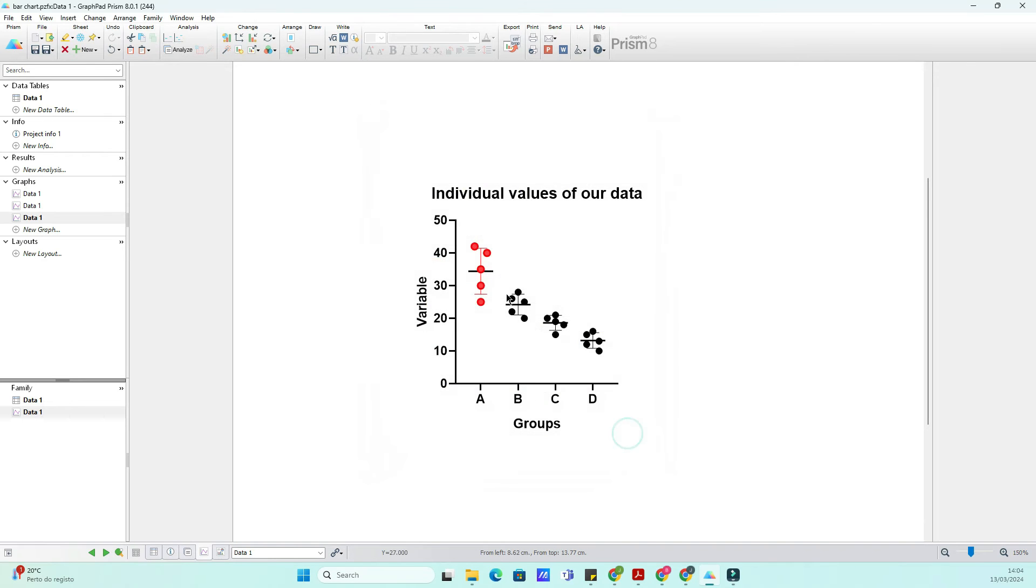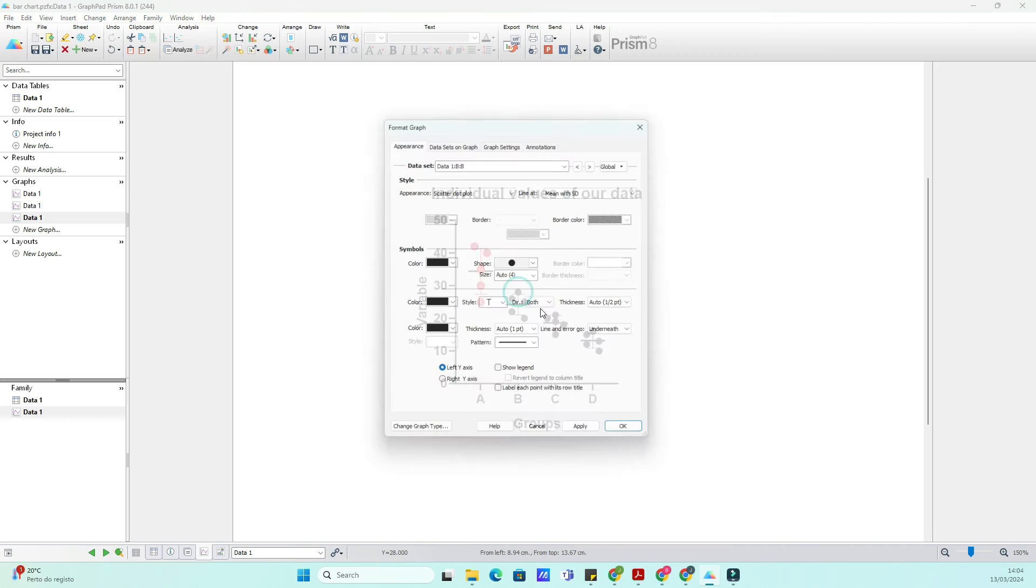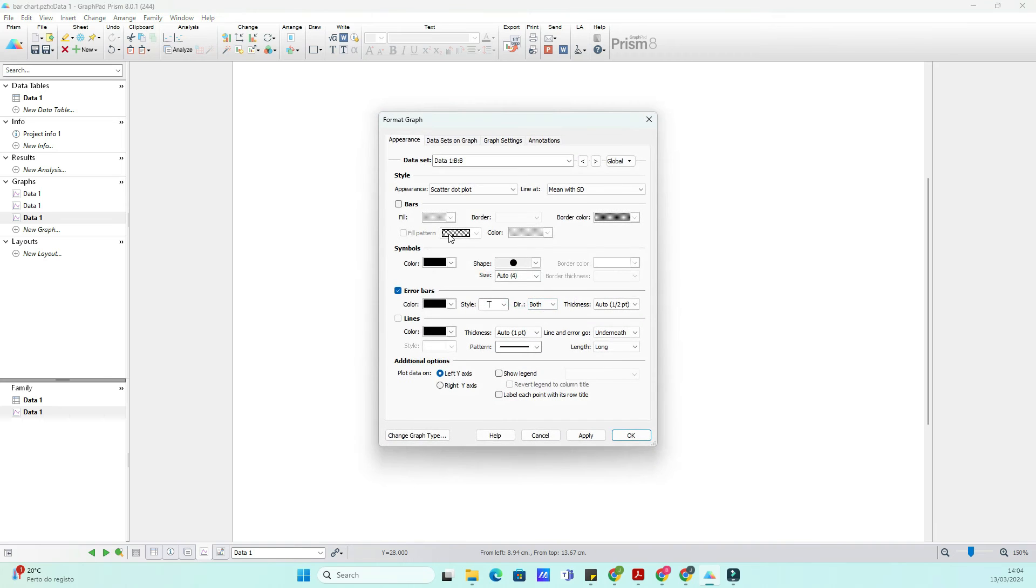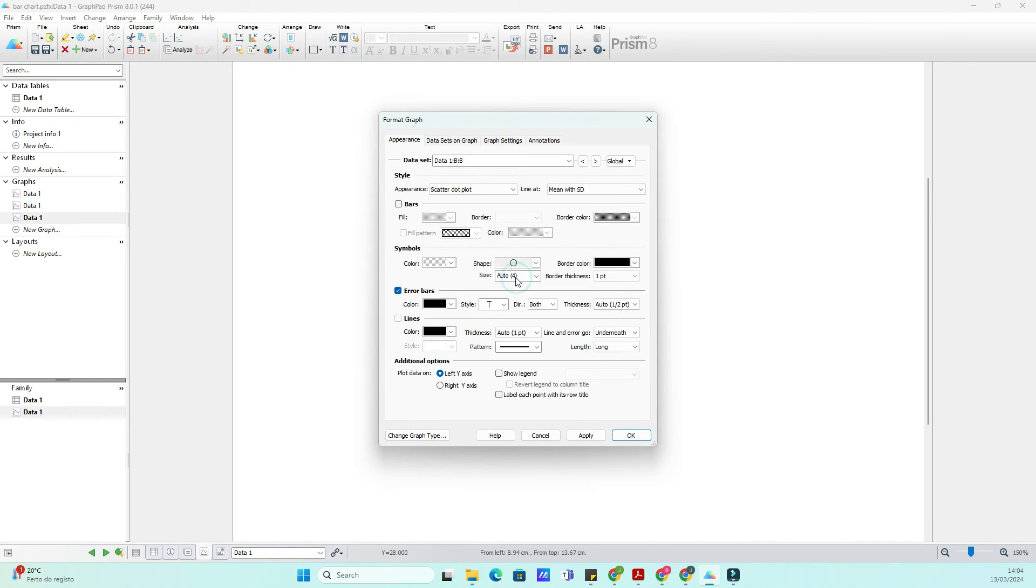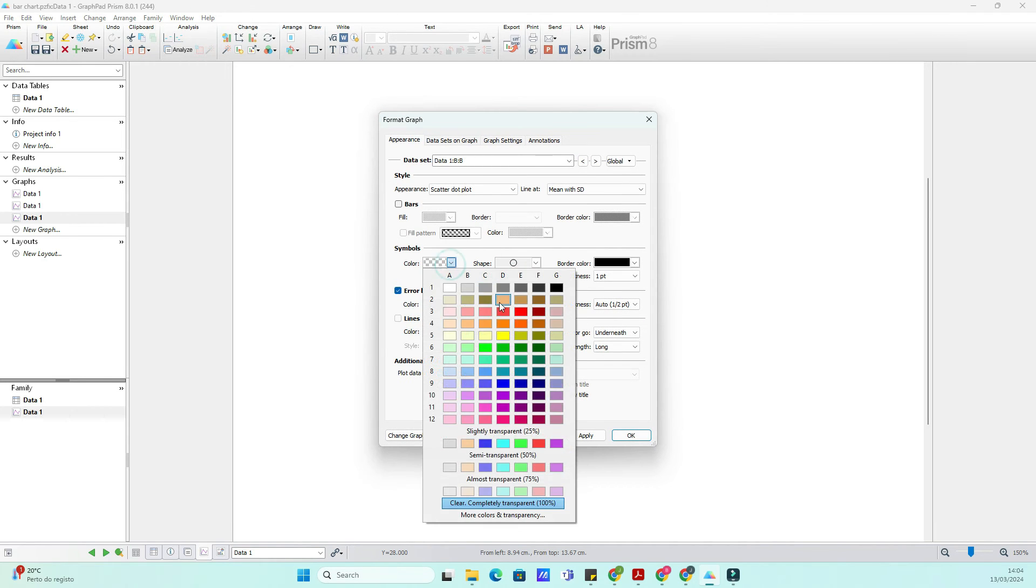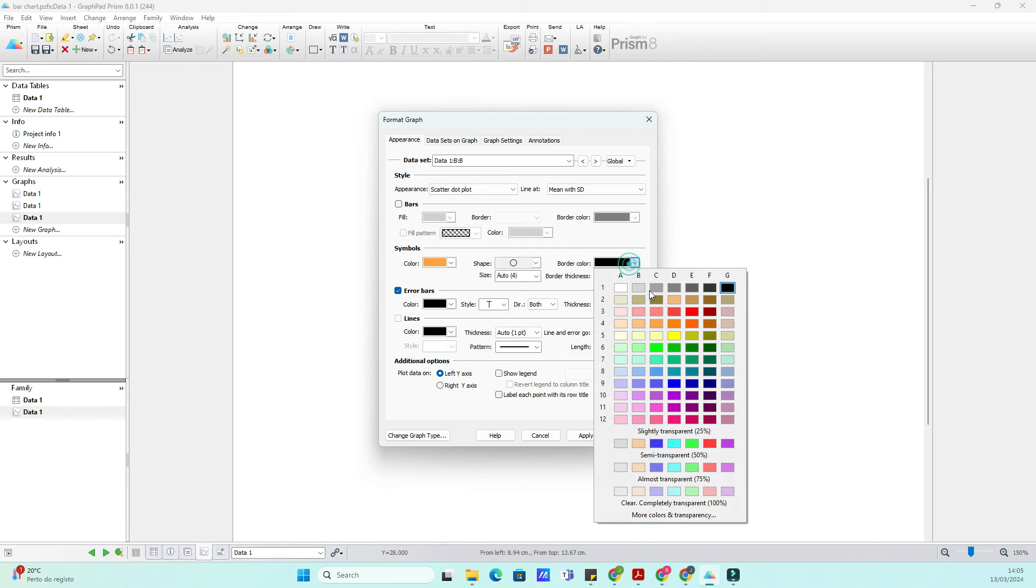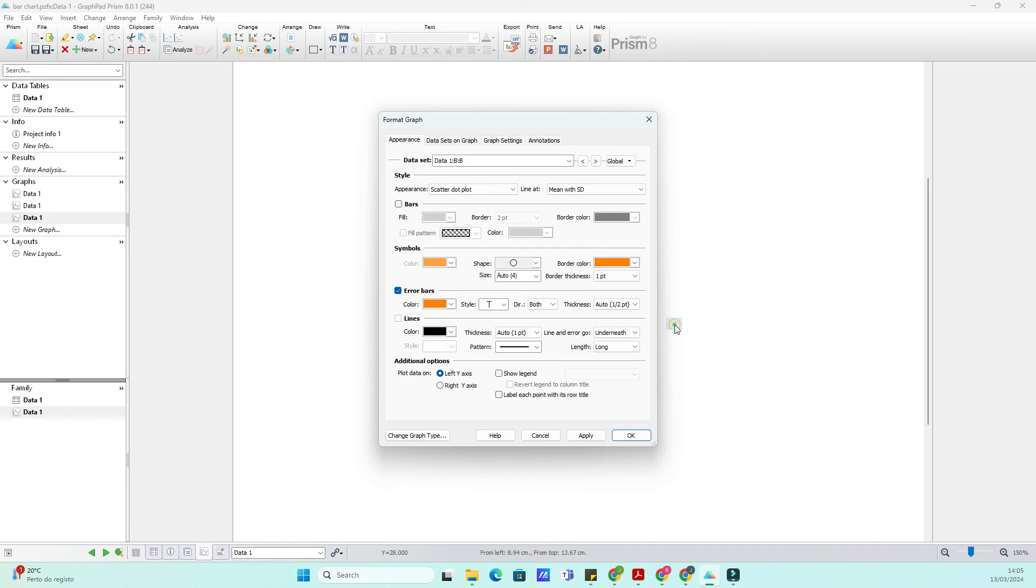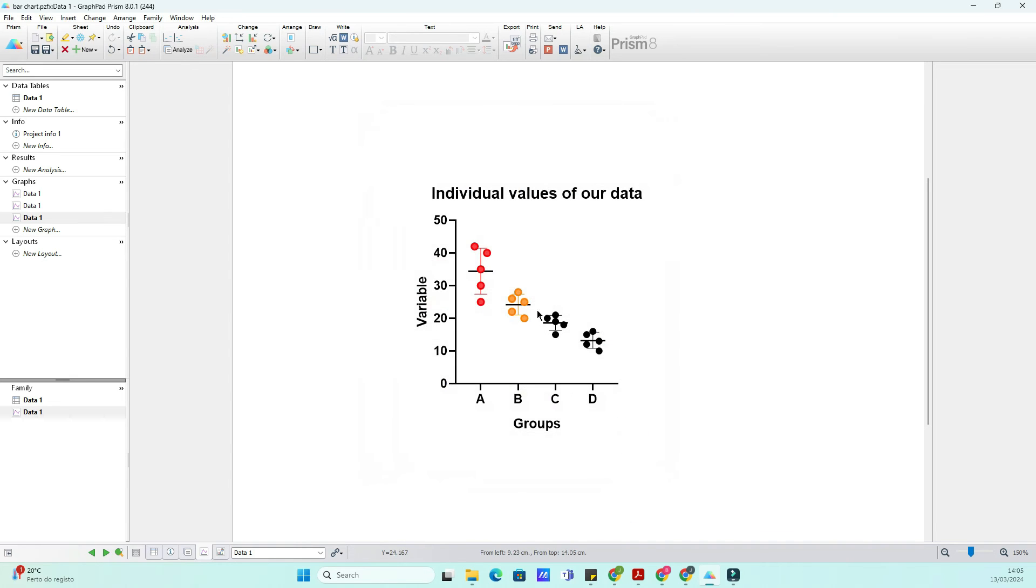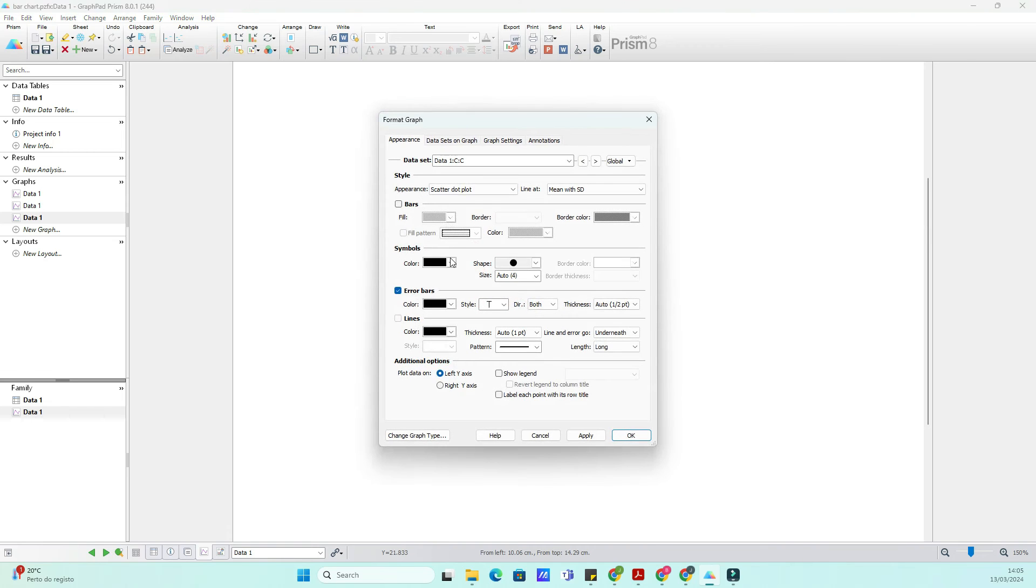Finally, let's add some final touches to make our plot truly beautiful. Consider adding a title, axis labels, and a legend if necessary. These finishing touches ensure that your audience understands your data at a glance and leaves a lasting impression.